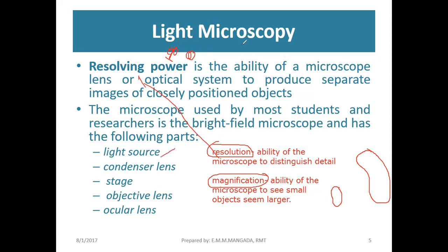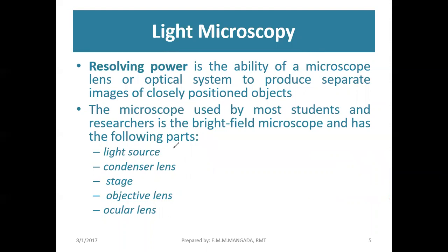We have the light source. From the term itself, light source, it's the one providing the source ng ating light. We also have the condenser. Okay, so we can adjust the intensity of the light coming into our object of interest, or yung ating specimen. The stage holds the microscopic slide, or the slide that you are viewing, and the objective lens further magnifies yung image na nakikita natin dun sa ocular.